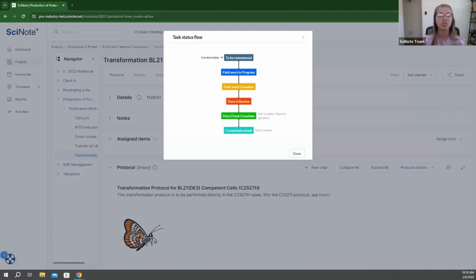Now, any questions regarding custom roles, or even combining custom roles? Maybe you want to have a role that can only create reports, or you could have a role that is specific to your inventories. Maybe we want to combine all three: custom reports, custom roles, and custom workflows. The options there.